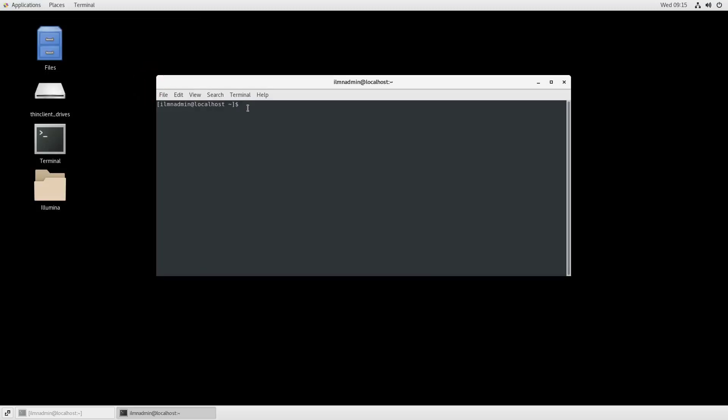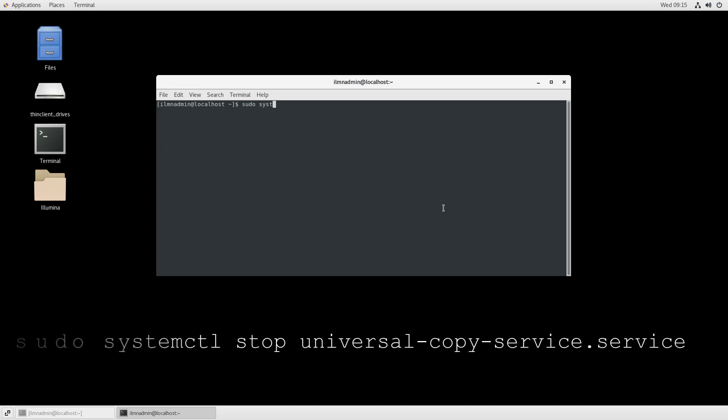To stop Universal Copy Service, type sudo systemctl stop universal-copy-service.service and press Enter.